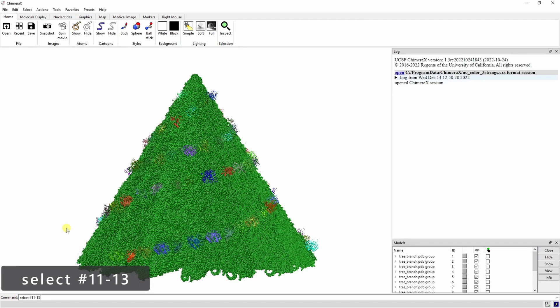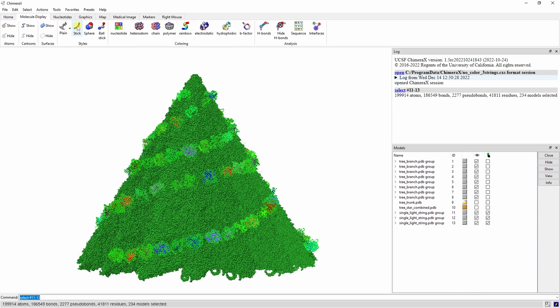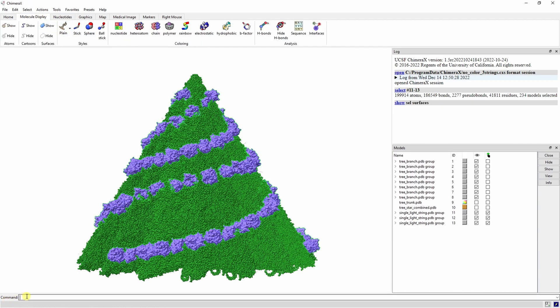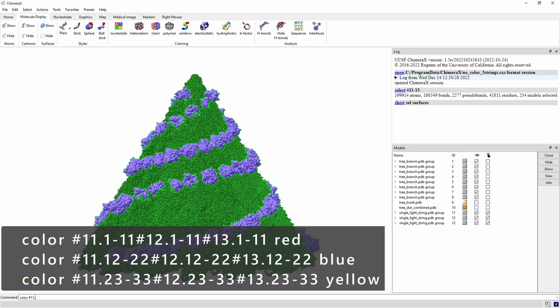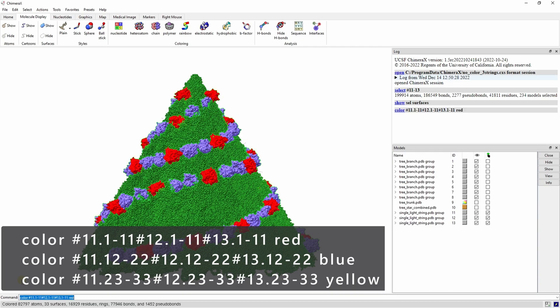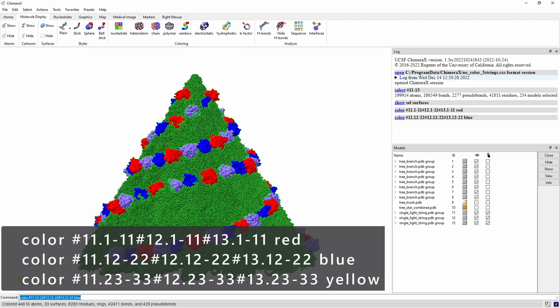Select these three models and show their surfaces. We can go back and color them again by specifying that we want to select the light string submodels 1-11 of models 11, 12, and 13 to be red. Then submodels 12-22 to be blue and submodels 23-33 to be yellow.